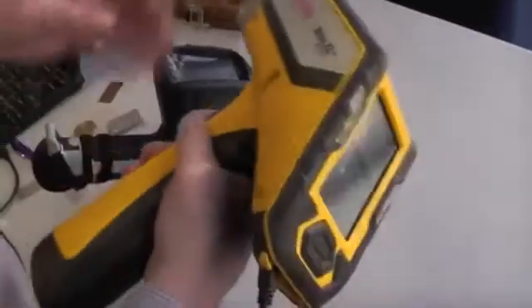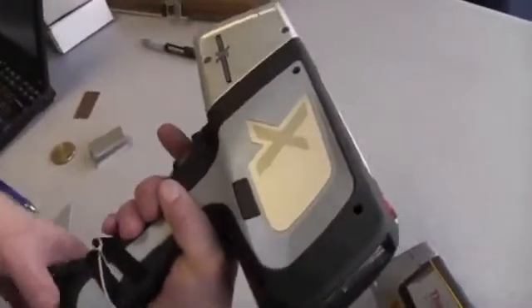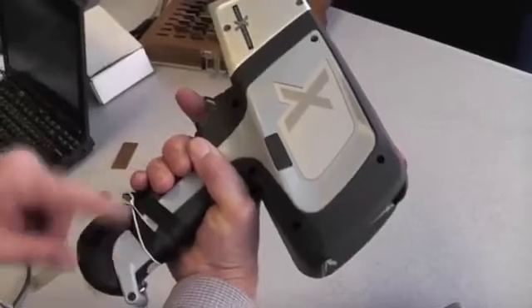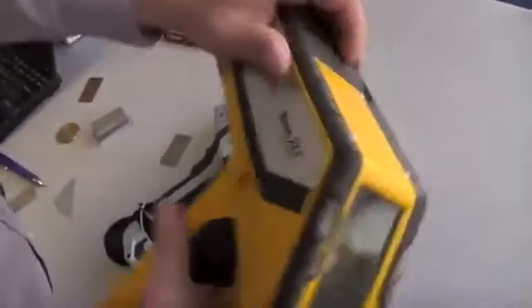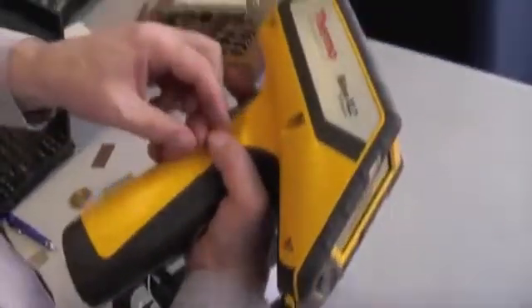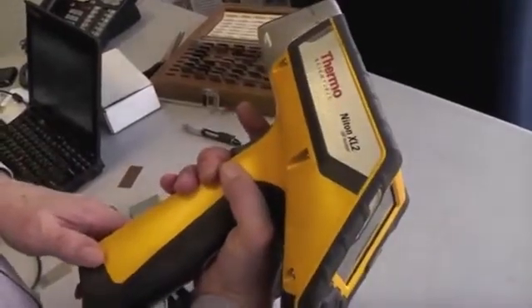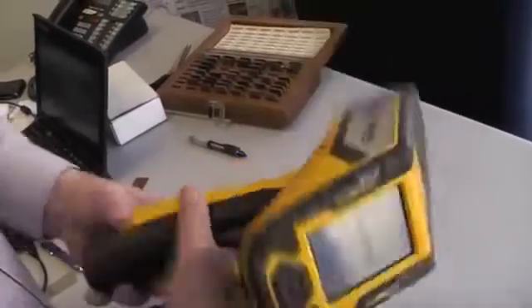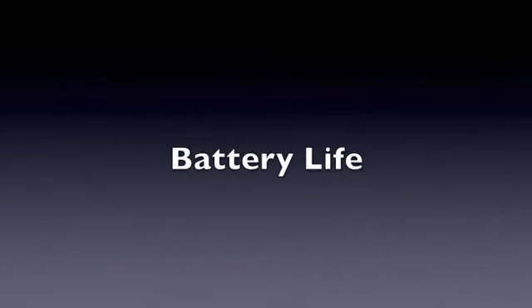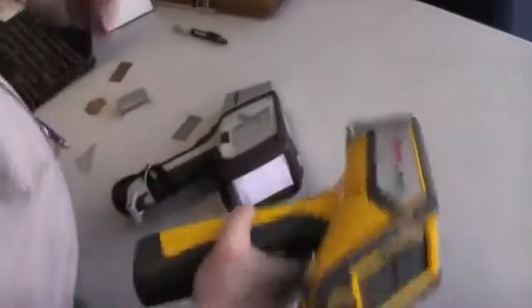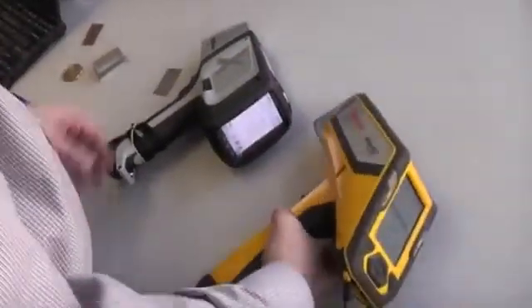This handle is big to hold onto. The ergonomics of the handle are poor compared to this system. You can see that my fingers overlap right there up by the grip. When I'm on this one, you can see it's almost the length of my nail different to get a hold of it there. It's that much bigger around. The battery life costs them in terms of balance and also the ergonomics. The handle is very thick.